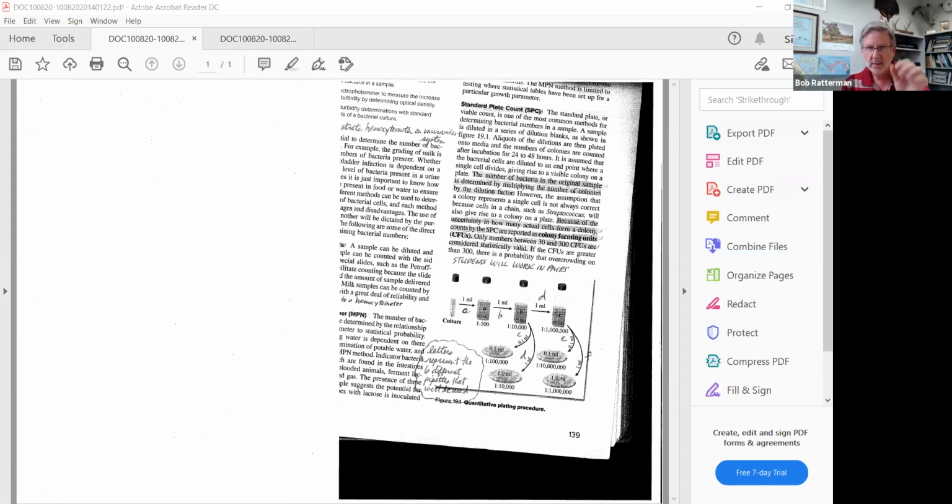I will give you a sample, a bacterial sample, either a slant or a broth or a plate, and you will actually then perform the stain that you chose. I will probably occasionally look to make sure you're following a good aseptic technique, but I will not be hovering over you, but I will be watching.